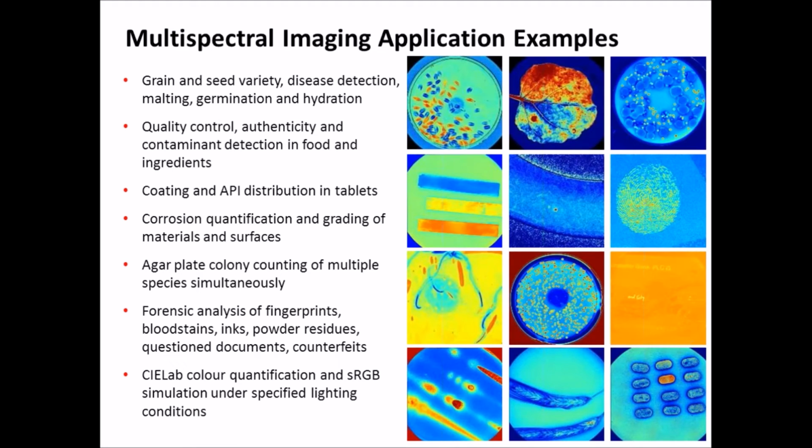Pharmaceuticals is becoming a very popular application. You can look at things like coating and API distribution in tablets. Materials and surfaces, grading, I've used corrosion here as an example, but really any kind of surface analysis is applicable. A nice little trick is agar plate colony counting.